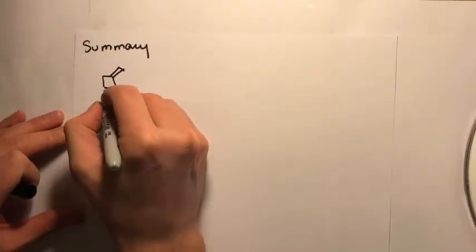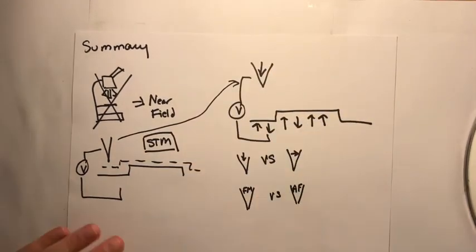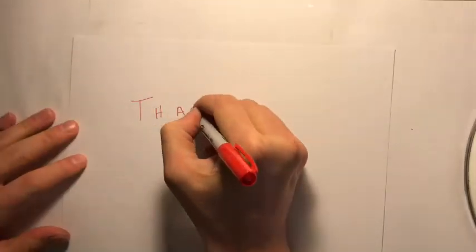In summary, spin-polarized scanning tunneling microscopy is a powerful near-field technique that allows you to avoid the diffraction limit. It can be powerful, flexible, and fun.